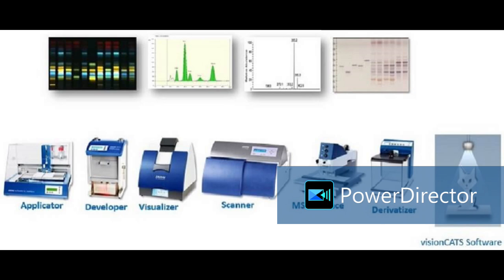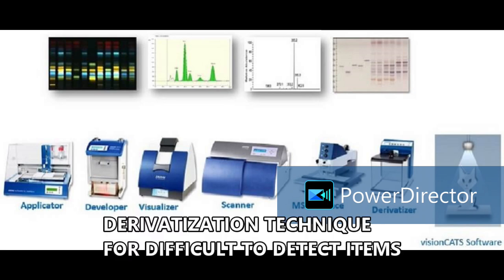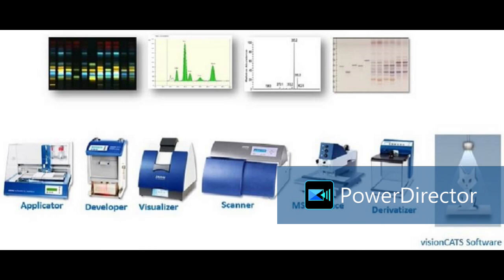So for detection of non-chromophoric compounds, we have to derivatize the plate. For that we are using the derivatization technique. Okay. So after derivatization, again we can do imaging and scanning of the plate. For sugar analysis, after development nothing is visible, so go for derivatization, then go for scanning and quantification. So this is the stepwise practice of HPTLC.